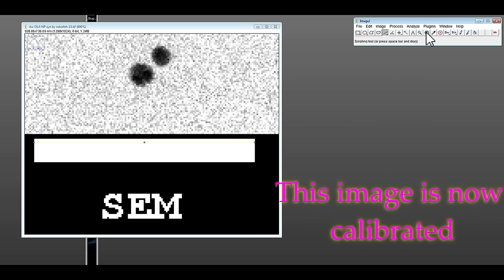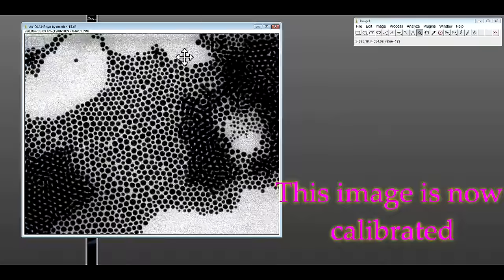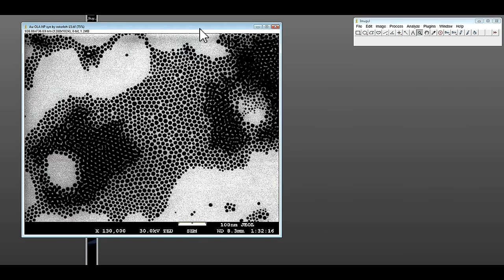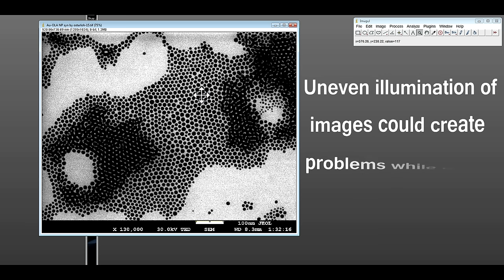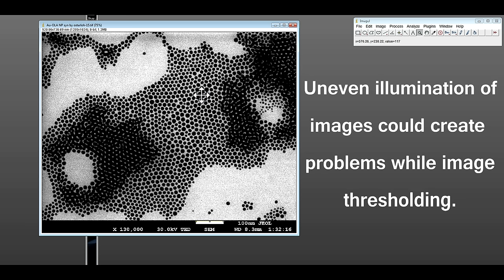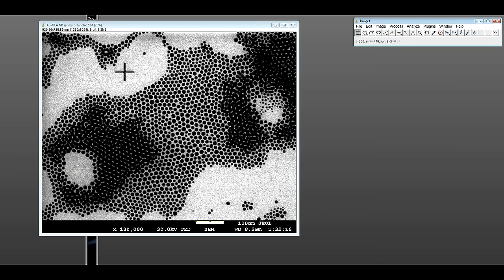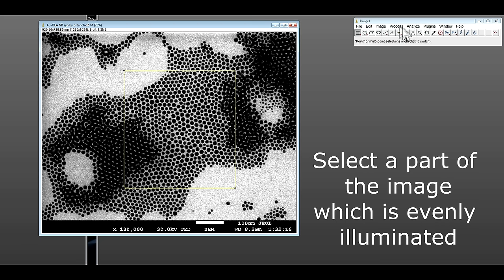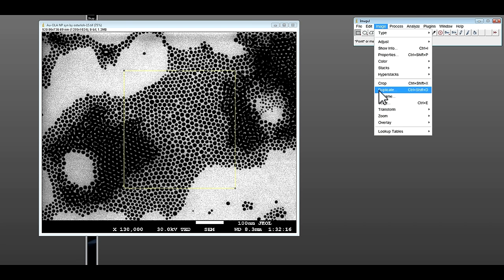And for particle size analysis, evenly illuminated image is very important. Let's use this element, let's duplicate it.